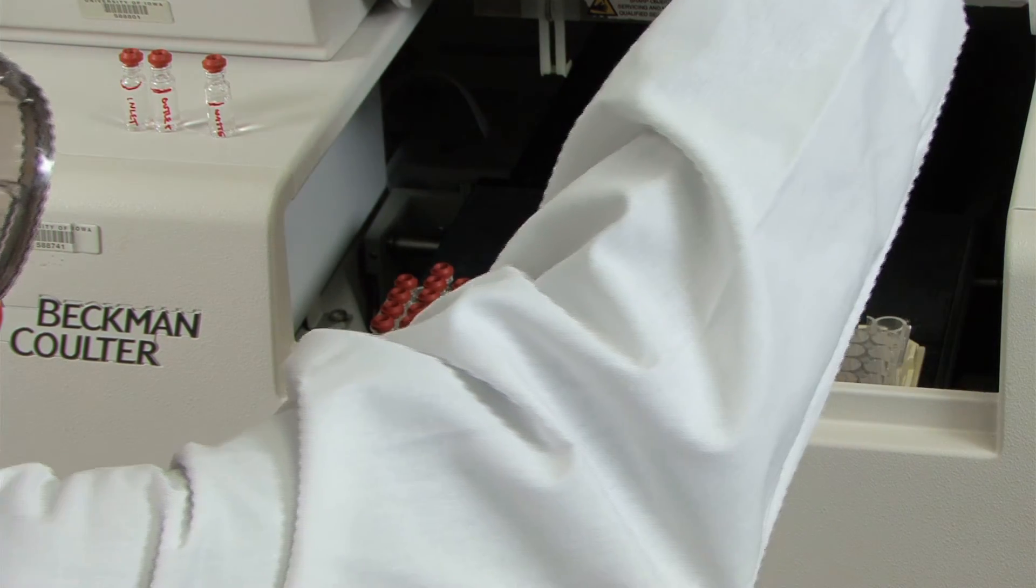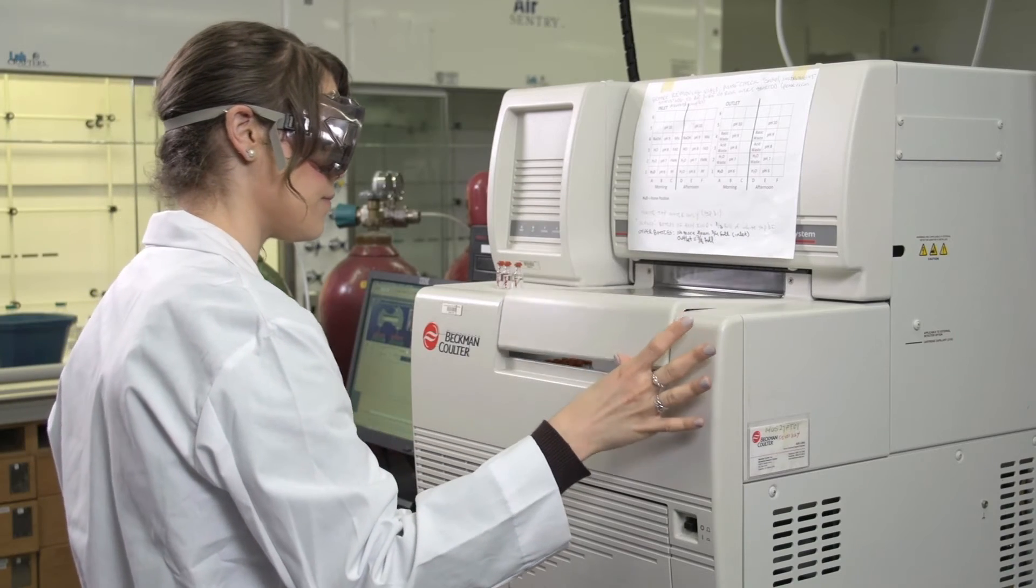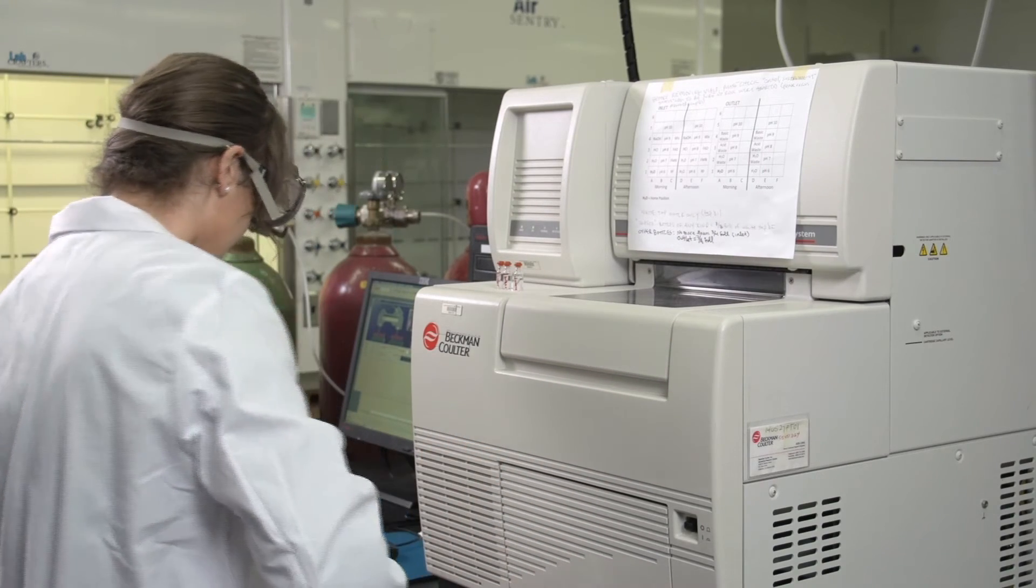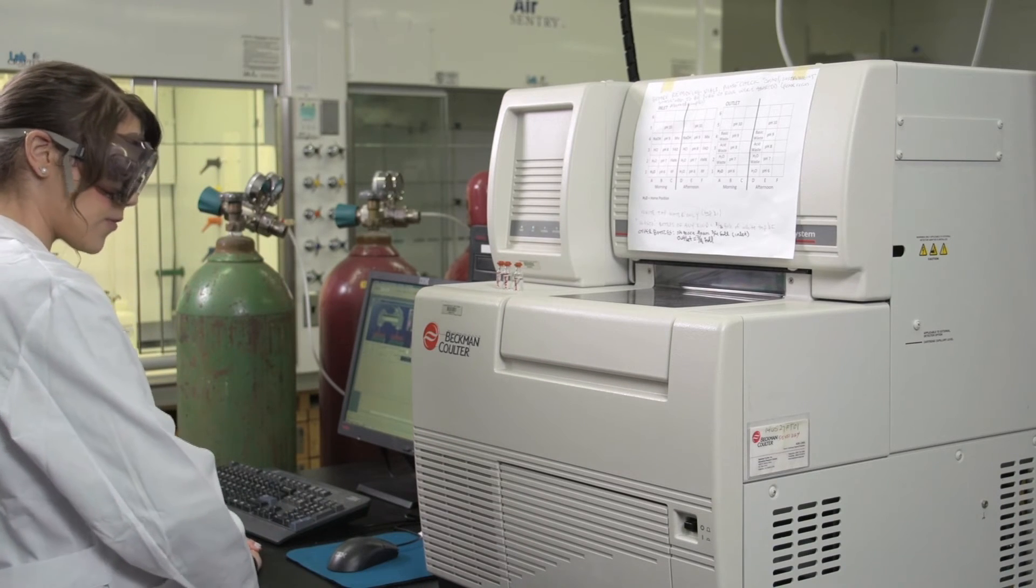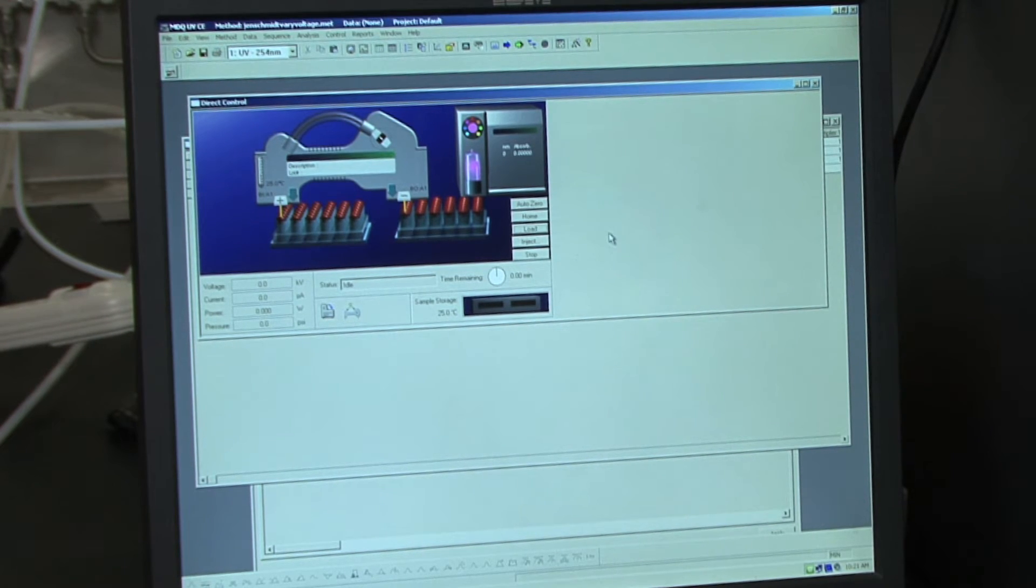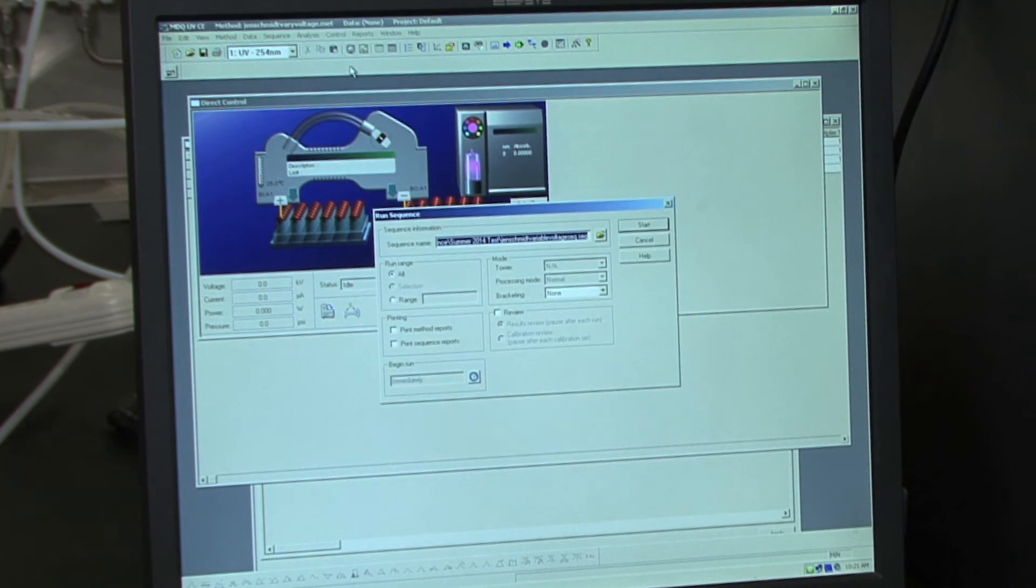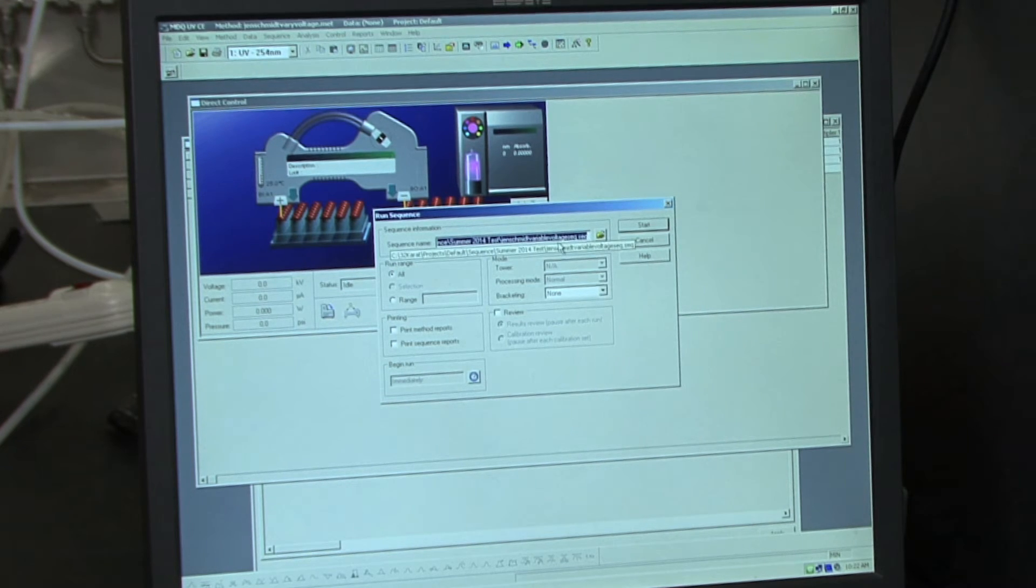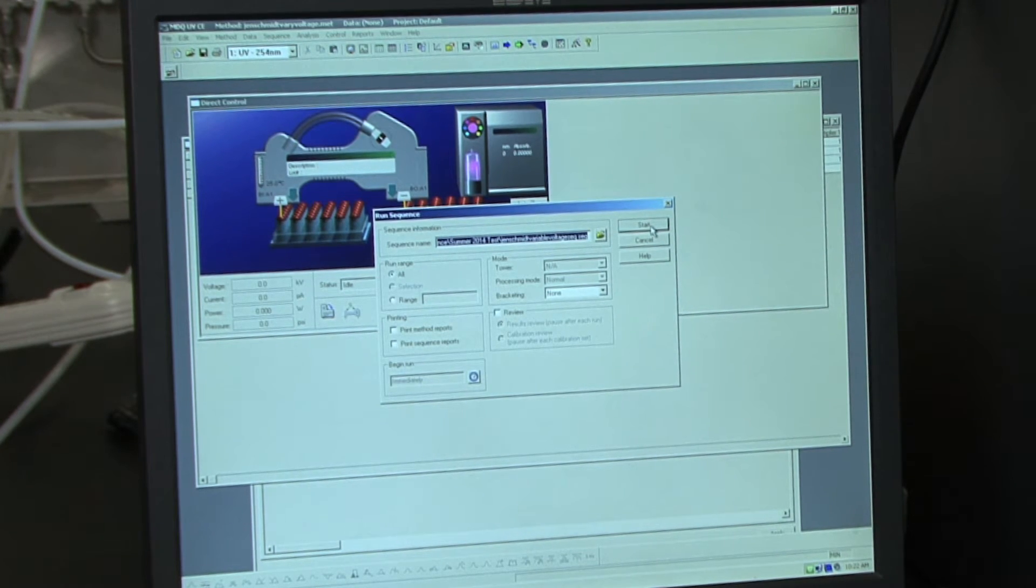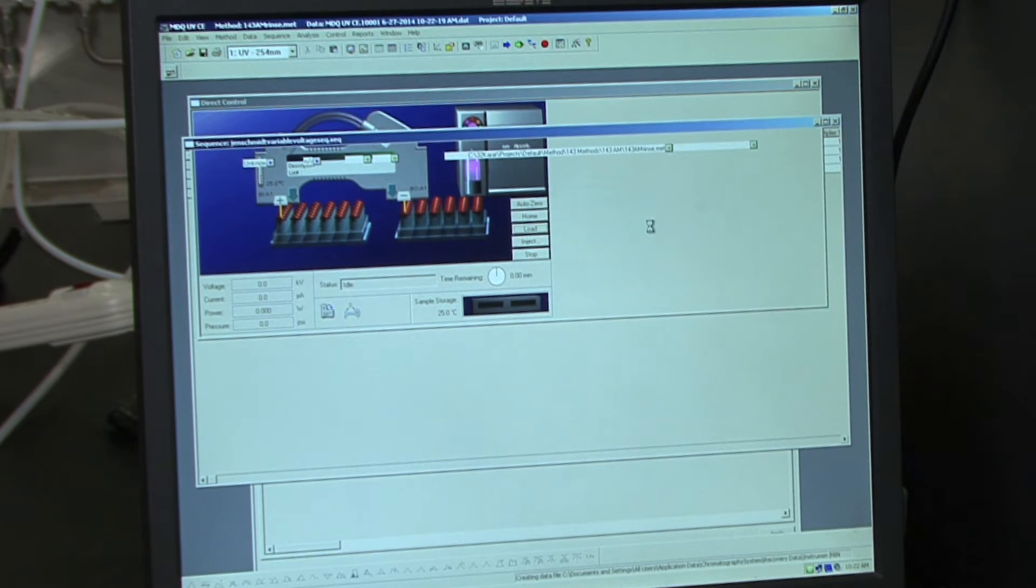Once you have loaded all of your samples, you can close the lid. And now we are ready to inject our samples. To inject your samples, you need to click on Control, Sequence Run. And you want to make sure that the sequence that you saved appears in the cell. And then hit Start. And this will inject your samples.